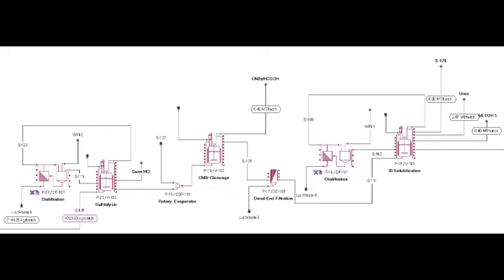Operation Unit 19, Rotary Evaporator CSP101. The formic acid, the unreacted cyanogen bromide and the generated cyanogen gas are removed by applying vacuum and a temperature around 35 Celsius, the boiling point of the cyanogen bromide, inside a rotary vacuum evaporator.